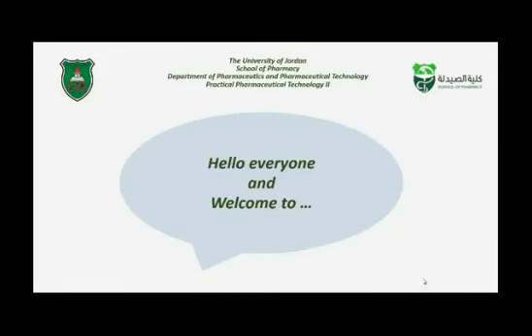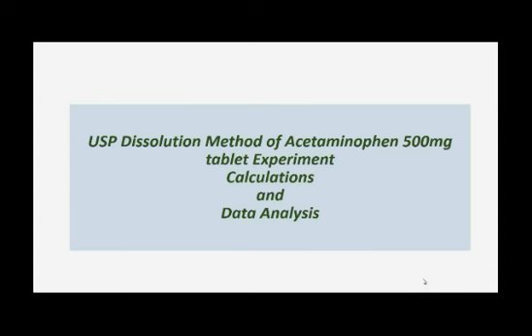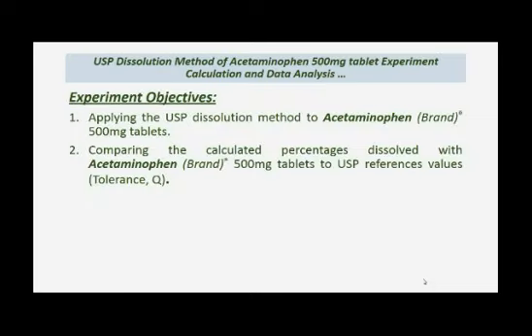This is USP dissolution method of acetaminophen 500 mg tablet experiment. Data analysis and calculations. Our objectives were to apply the USP dissolution method to acetaminophen 500 mg tablets and to compare the calculated percentages dissolved with the USP reference values, tolerance or Q.